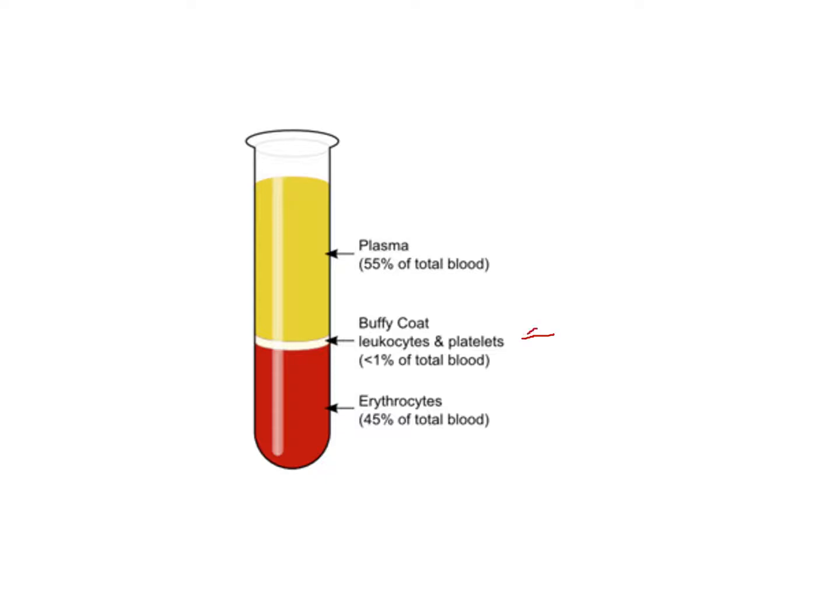If somebody had like leukemia, they would have a lot of white blood cells, and the leukemia buffy coat would be much bigger. So right away they could tell when they took your blood, I mean, if they couldn't figure out by the other symptoms, that you'd have a lot of white blood cells. Okay, it's normally 1%. Okay, when that gets 5, 6, 10, there's issues.